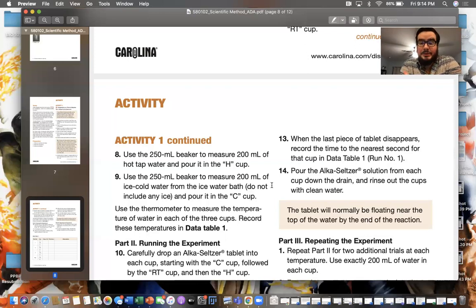No, it's not boiling. Don't boil water to do this. You don't want to hurt yourself. All right, so I am right at about 40 degrees Celsius. Again, not crazy high over room temp, but for our baseline of room temp, it's high.